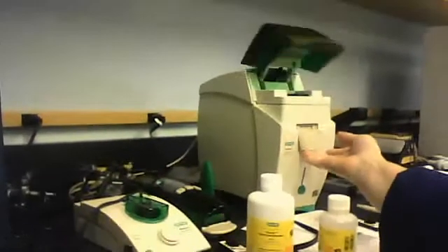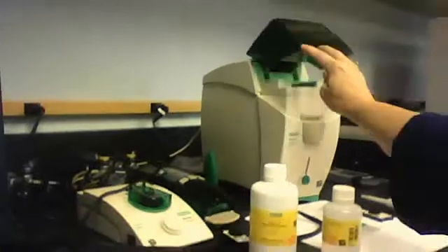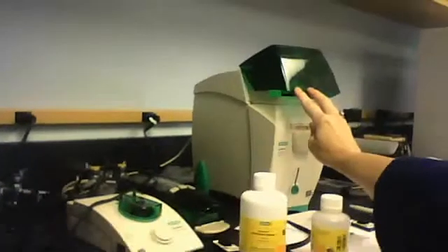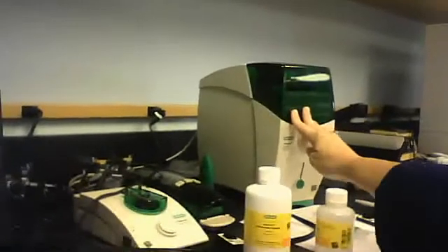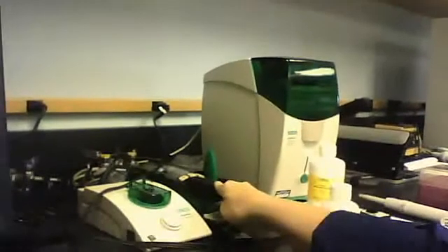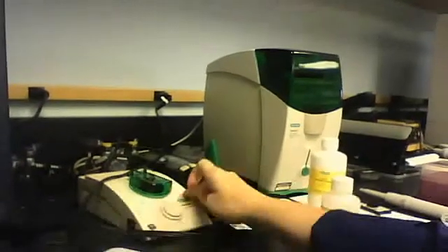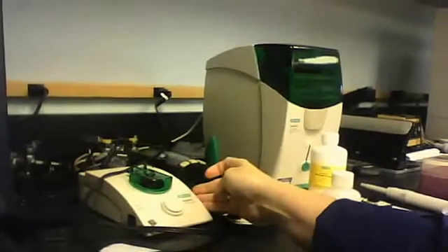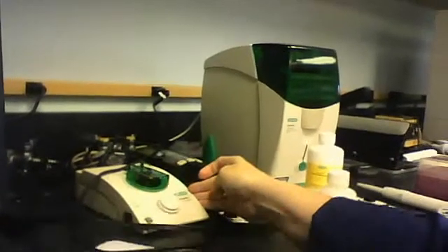And this is actually what the machine looks like, the main Experion machine. It's got a little hatch that comes up like that and you can close it down. This is the priming unit. You'll need that and you'll need this as well, the Experion Vortex station.